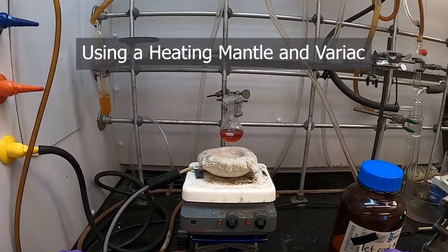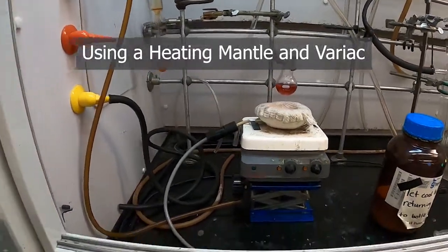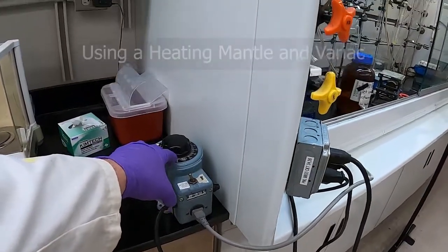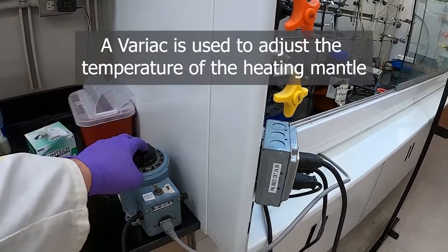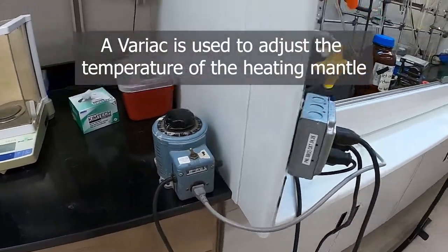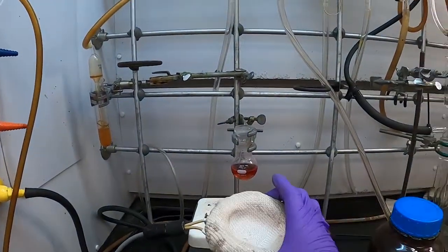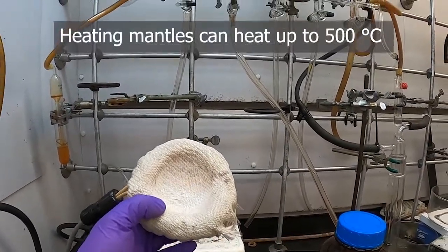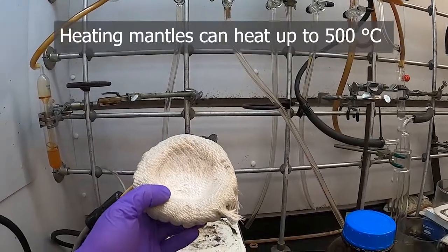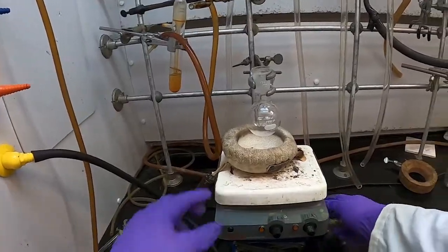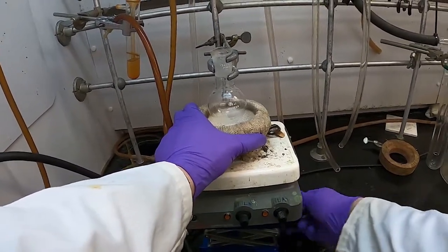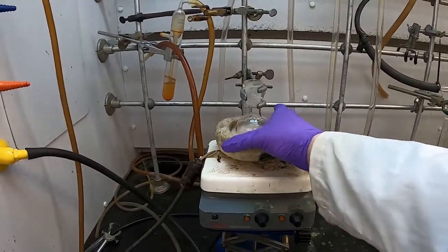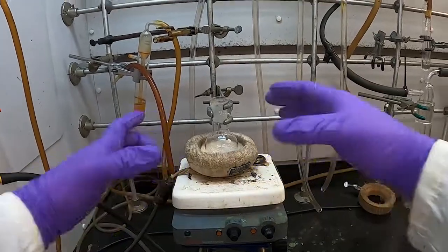Another way that we can heat things in the lab is with a heating mantle and a variac. That's what this device here is. So the variac is a power supply for the heating mantle, and it gives us a control of the output of the heating mantle. Heating mantles consist of a series of wires inside this insulating mesh fabric that when the current passes through them, heat up the wires. Heating mantles would be raised again, just like with an oil bath, to envelop your flask. This flask is a bit undersized or this mantle is oversized for this flask.